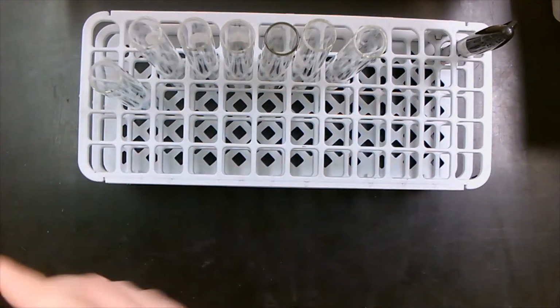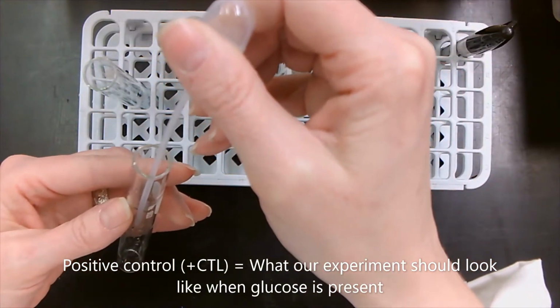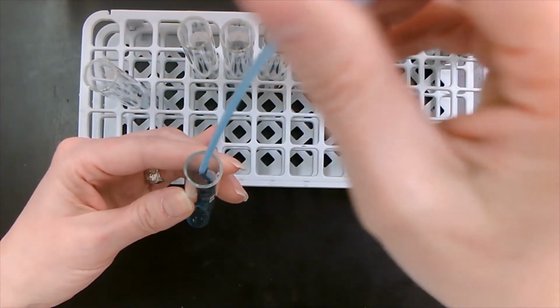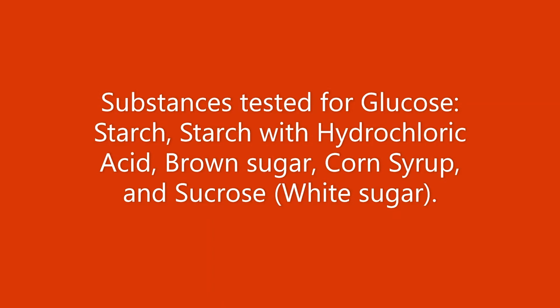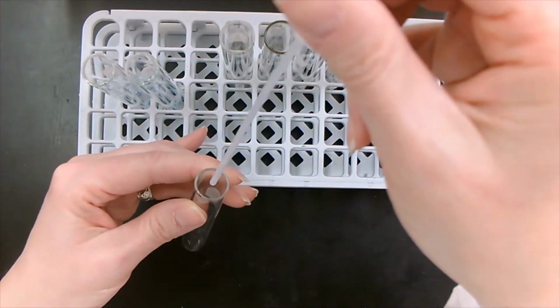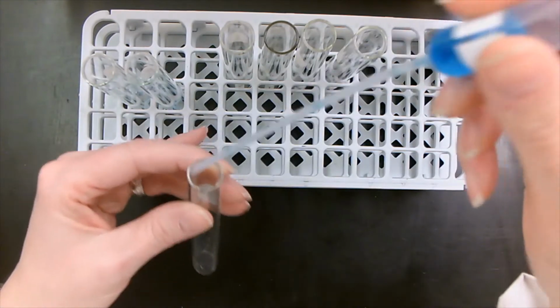For our next test tube, we are going to be adding glucose. Glucose contains glucose, so therefore glucose will be our positive control. 5 drops. And now let's add our 5 drops of Benedict's. For the next test tube, we are going to be adding our starch solution. And now we're adding our 5 drops of Benedict's.